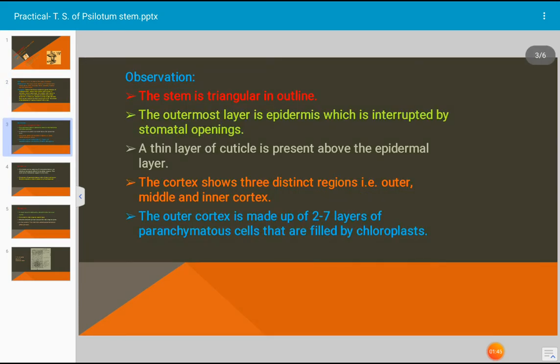What we have to observe: the stem is triangular in outline. The outermost layer is epidermis. Epi means outer, dermis means skin. The outermost layer of stem is known as epidermis which is interrupted by stomatal opening. Stomata are present.